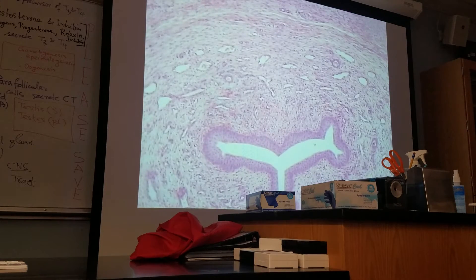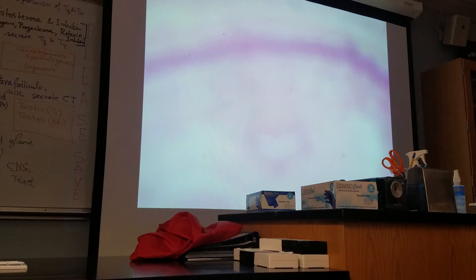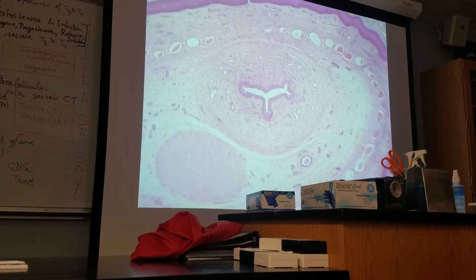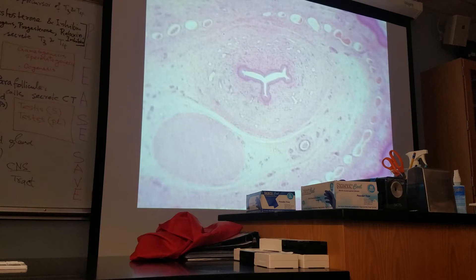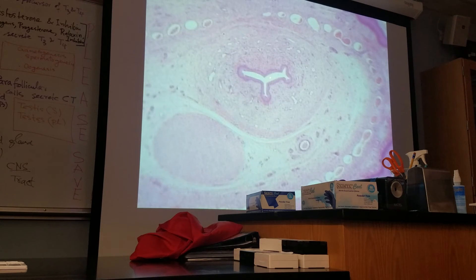So the question is to identify this as a section through the penis, or if you are asked to identify the whole structure, then you need to say corpus spongiosum. And if you are asked to identify the indicated structure, say penile urethra or spongy urethra. The male reproductive system is covered.